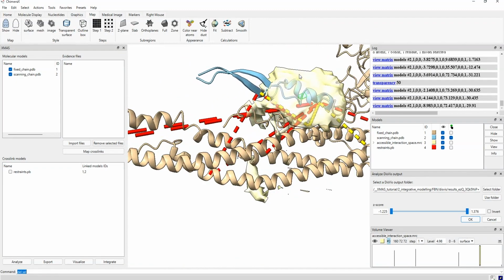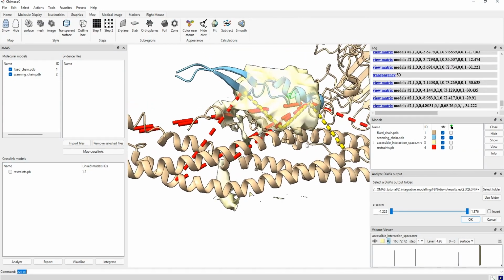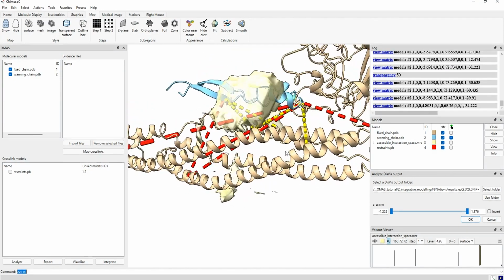It's quite useful to try to understand where your protein is placed, but we can do more. So here you see the Z score, which is to be taken with a grain of salt, but in principle, this score is inverted.